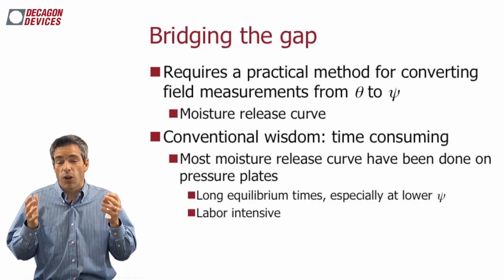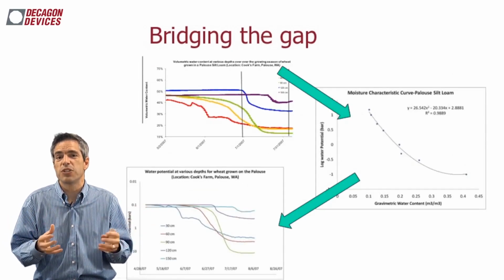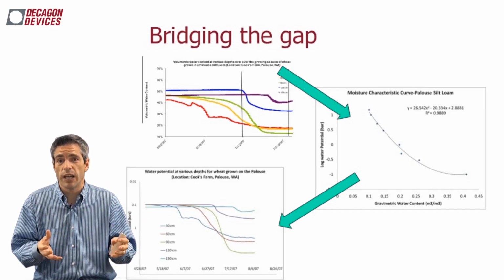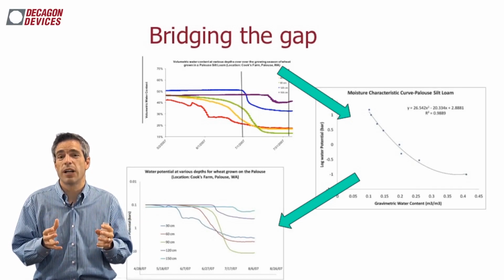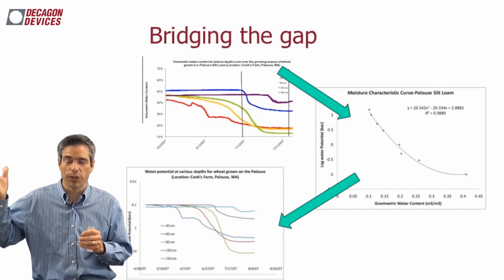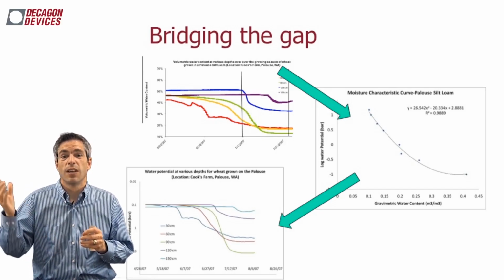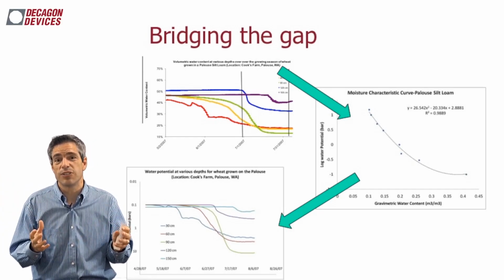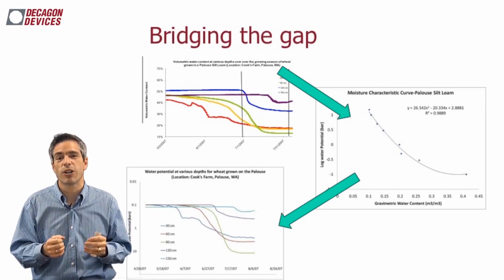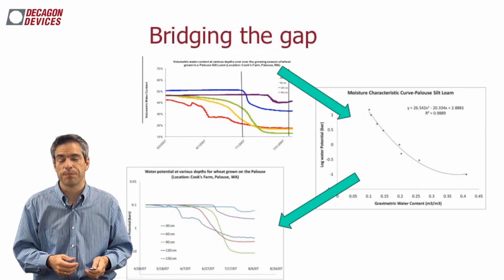So we decided that we would break through this conventional myth that these SWCCs are time-consuming and not a great way for this analysis, and we went out there and took our water content measurements that I'm showing on the near graph here in the color at the top, went through SWCC that we created in our own lab, and then converted our water content measurements into what we really wanted, which was water potential.